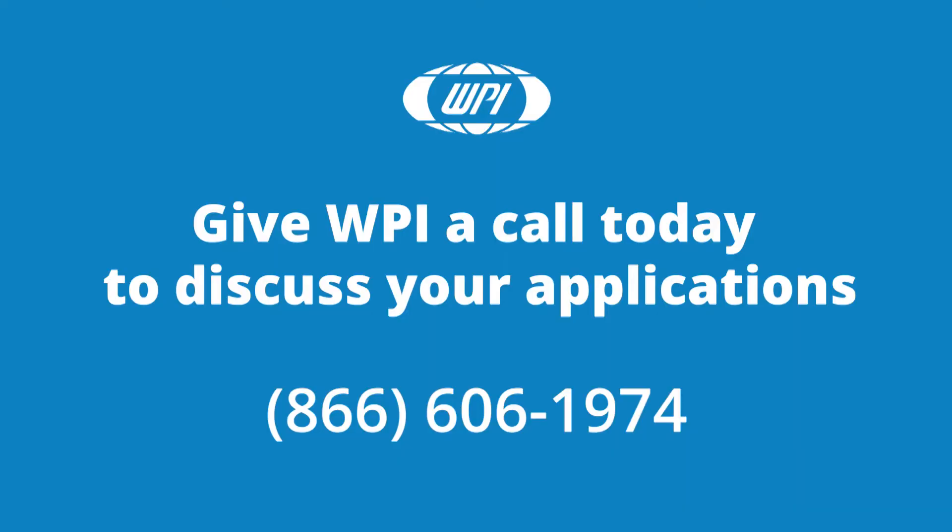That's it. Now you're ready to load a program. If you have any questions, just give us a call.